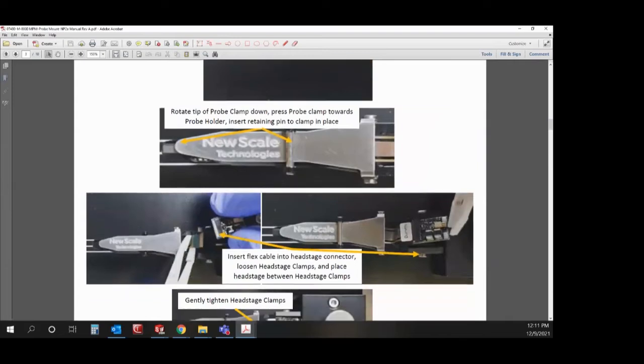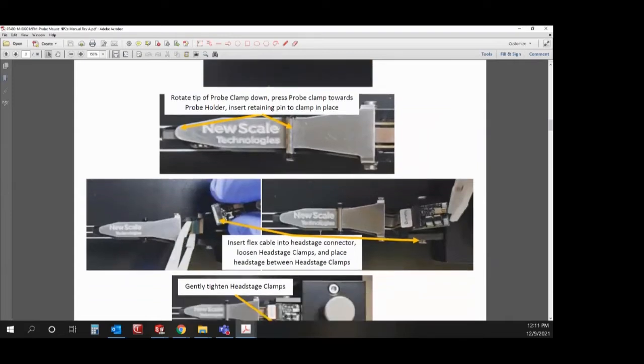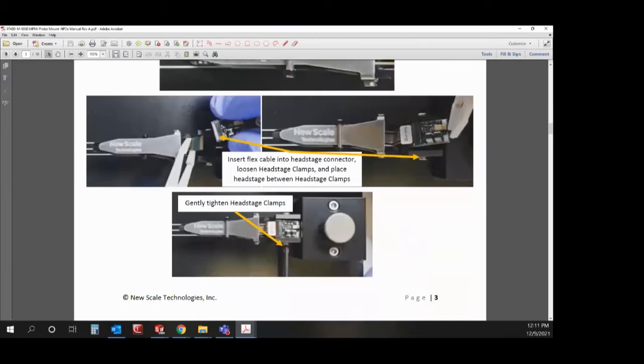Once it's installed, attach the flex cable to the head stage and then tighten the screws to clamp the head stage in place and you're ready to start recording.